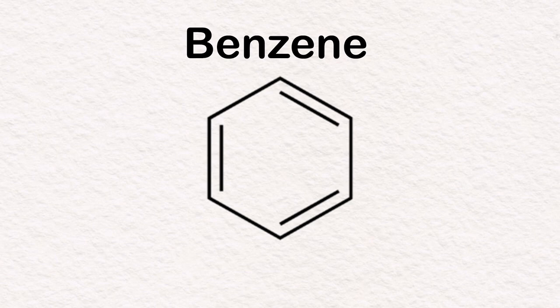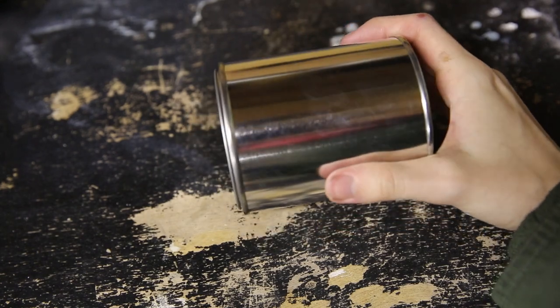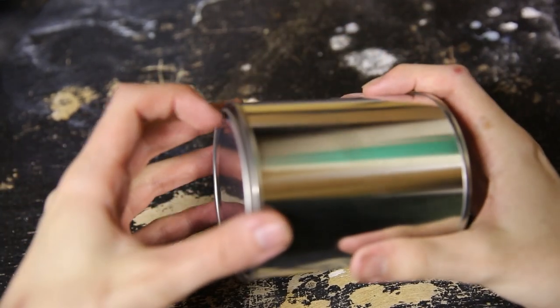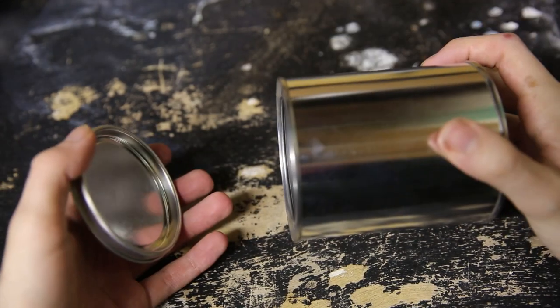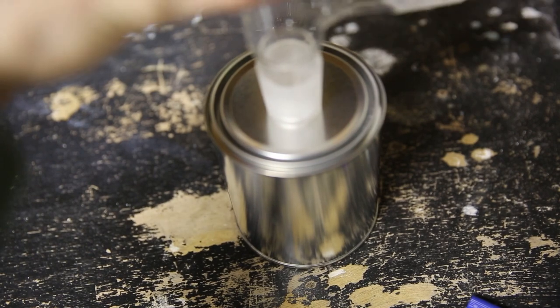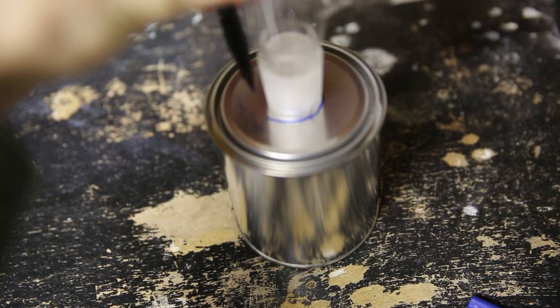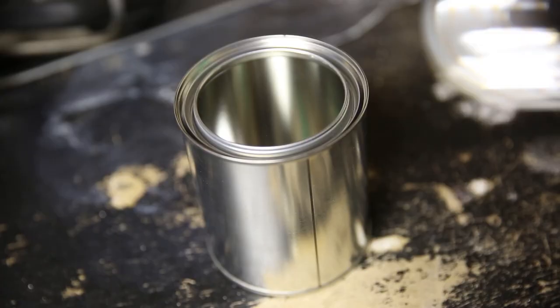Because the reaction requires a high temperature I need to use a metal reaction vessel. So I can just use an empty paint can which you can buy for really cheap instead of going through a lot of effort to clean out an old one. An adapter needs to fit and seal into the lid so the benzene will come out through the adapter and it is then possible to condense it by attaching a condensing column to it. I just mark the size and jam the screwdriver through the lid and then use some scissors to cut out the hole.